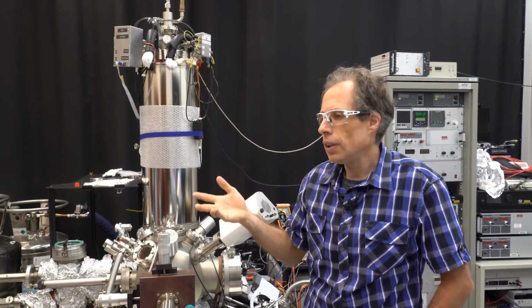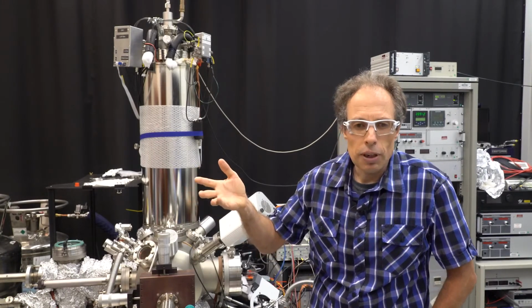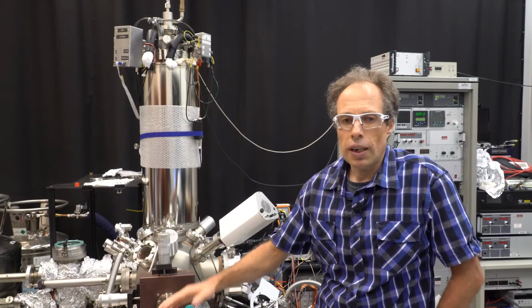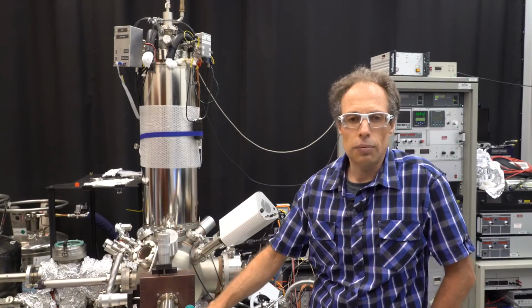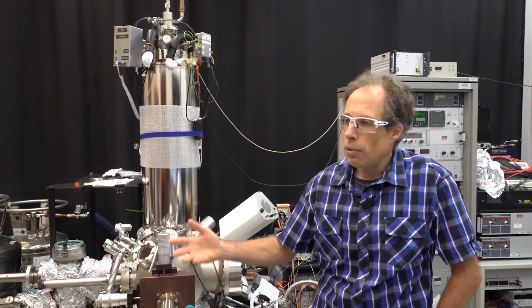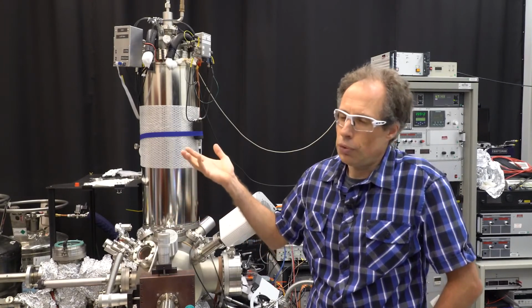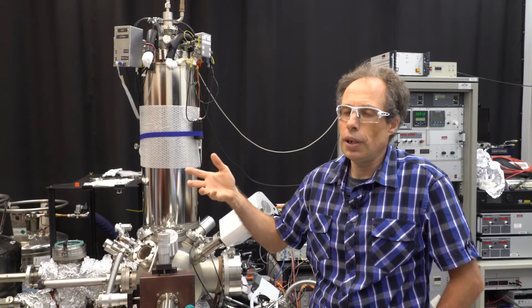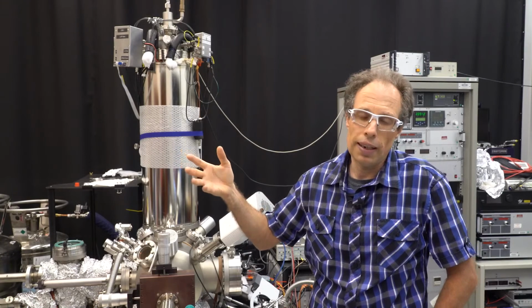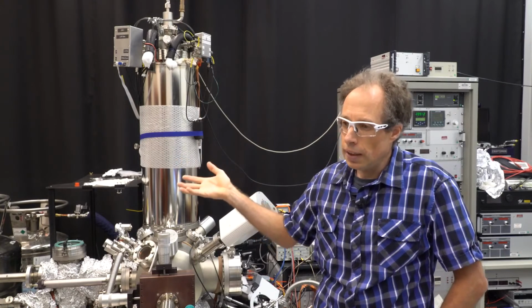And those images, once everything is working, are kind of like magic, because they look pretty much like in a textbook, these chemical structures. You see all these rings and atoms, how they're connected atom by atom. We can even identify different types of atoms or distinguish them to some degree. And those images are important because if you image single molecules, only then can you also look at complex mixtures of molecules like you have in petroleum. If you have a mixture of things you can't separate, all classic methods of analyzing the structure of molecules fail pretty much, because you have too many and they can't distinguish. But we can look at single molecules one by one.